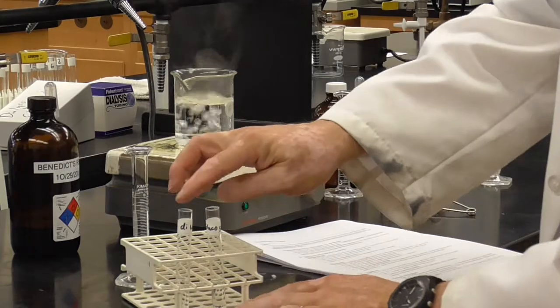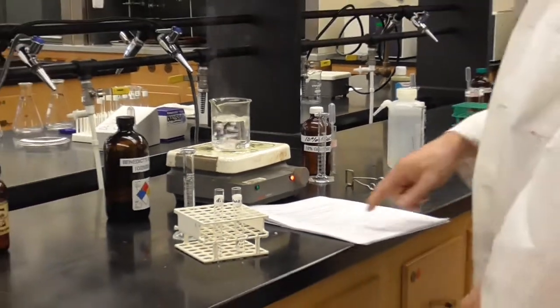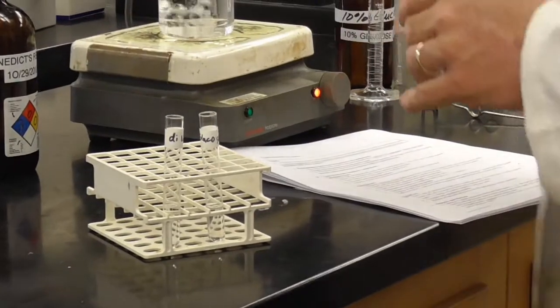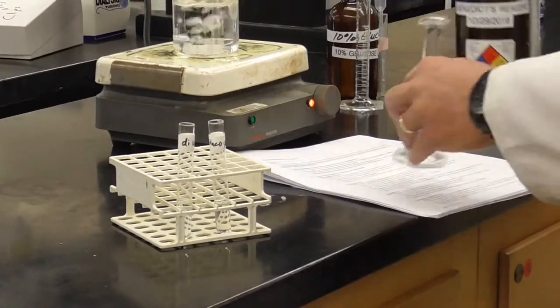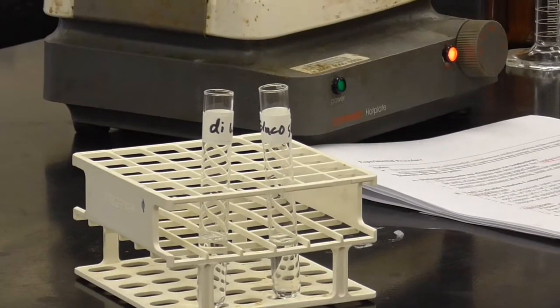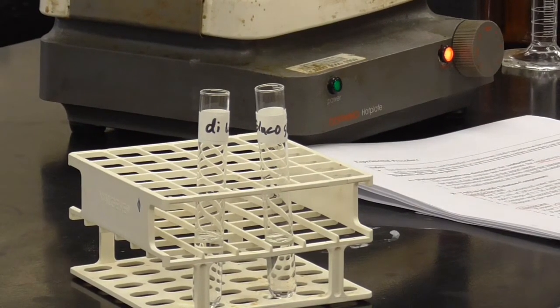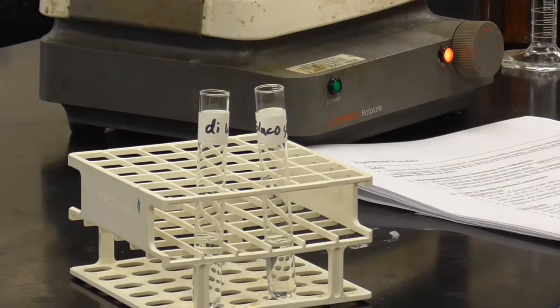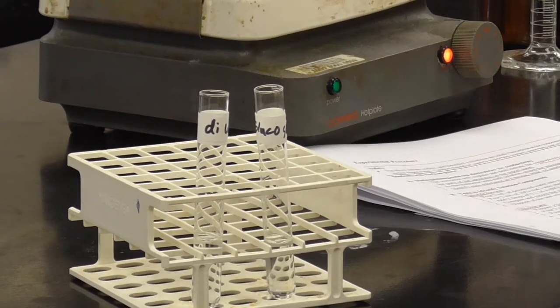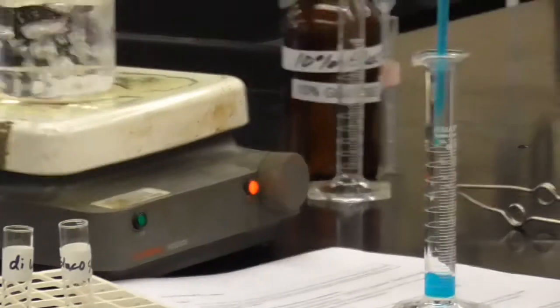Once again, our negative and our positive. Next up says add 3 milliliters of the Benedict's reagent. So here's our Benedict's reagent, 3 milliliters into each test tube. Nice blue solution, right? Very pretty, actually.